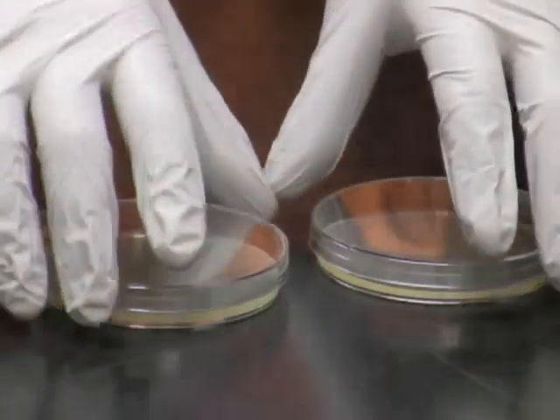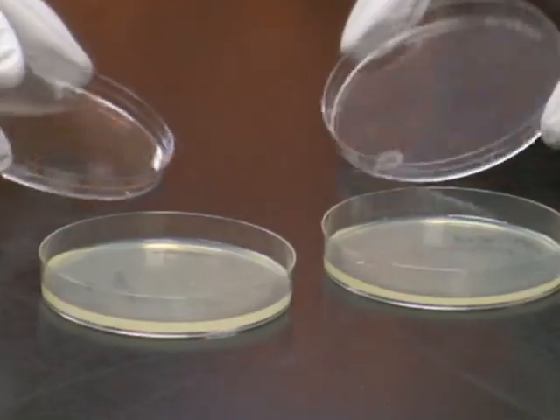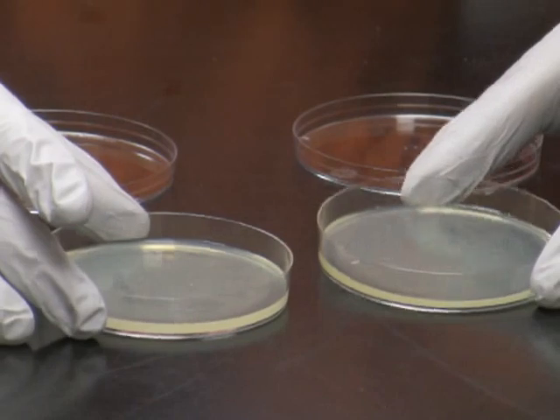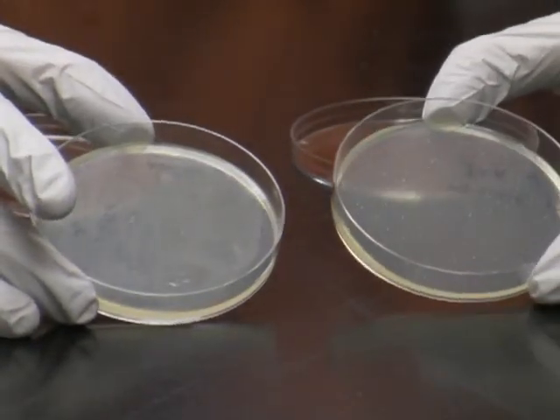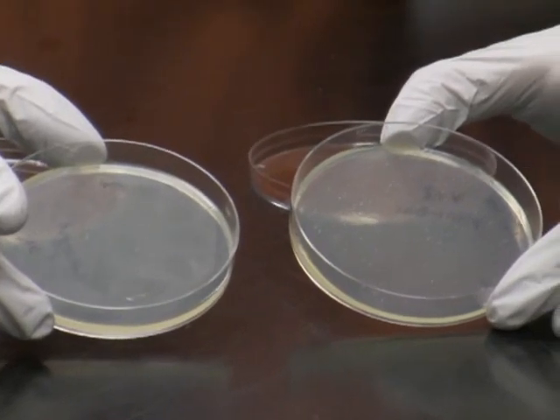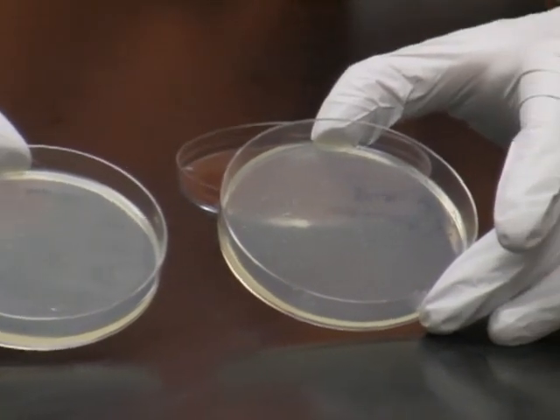On day 2, first thing in the morning, I rush to my plates to check for colonies. As you can see, I have about 30 colonies on the vector plus insert plate and nothing on the control plate, so I am pretty confident that most colonies contain the construct that I want to make.